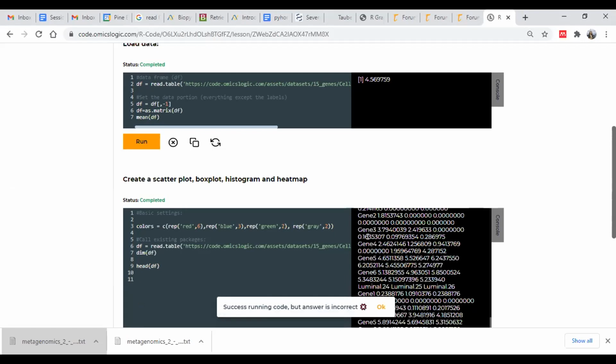So in the rows we have genes, and in the columns we have samples. You can define whether you want to color the gene or color your sample. As there are a large number of samples, that is 52, sometimes it would be difficult to color each of these samples. So what's the way? This is one way.